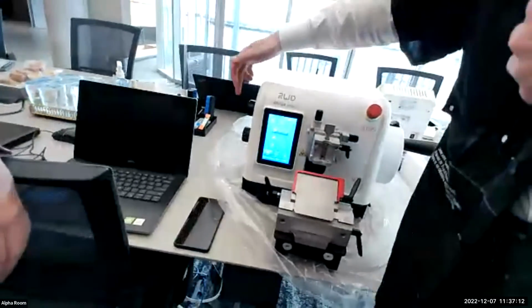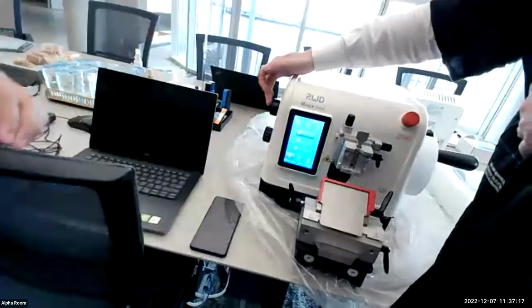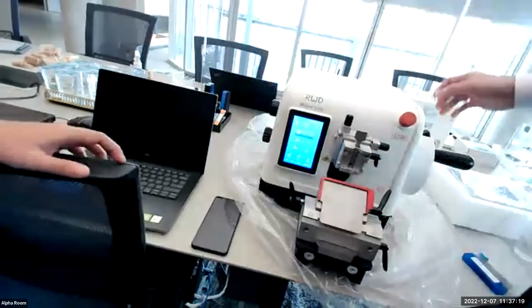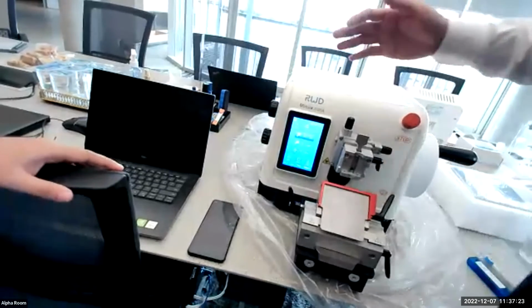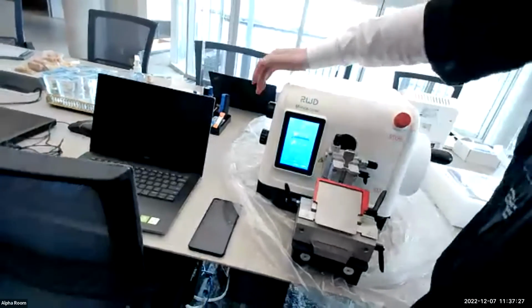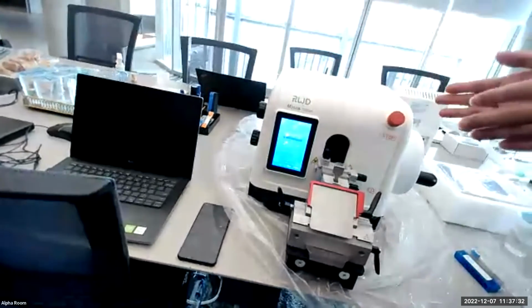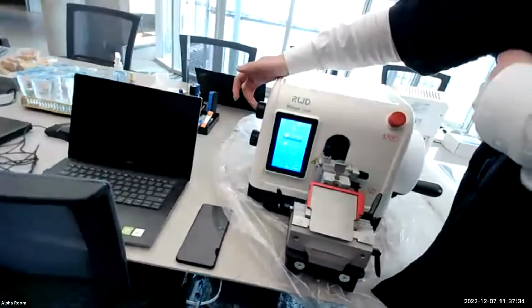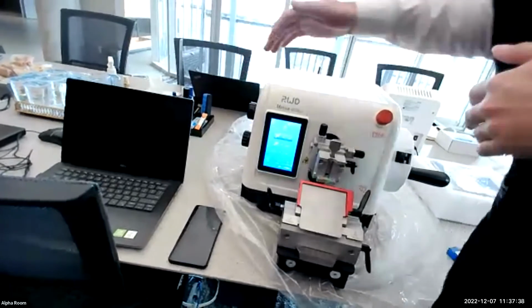And this knob has another function for the fully auto one. When we press it twice, we start the auto functions. But this function is only for the fully auto one. When we press it one time, it will stop.